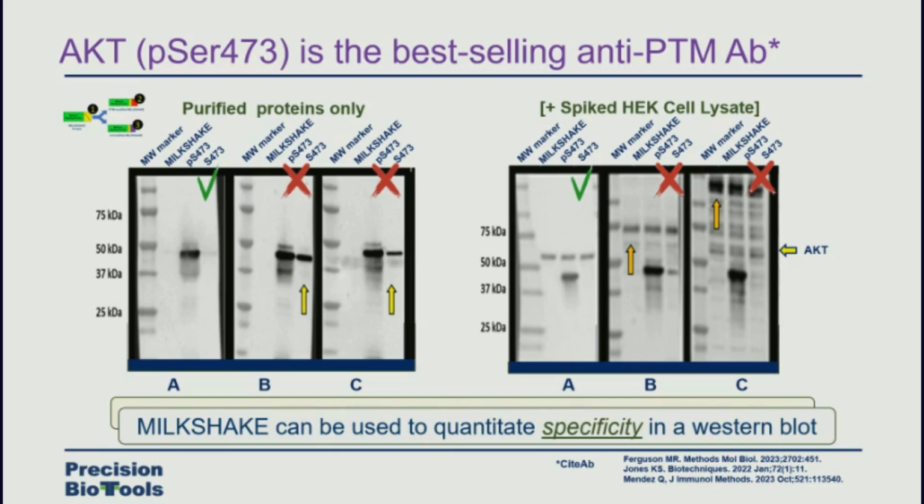If you go by publication number, A is used thousands of times as compared to B and C. So Andrew's not here, so I can say I don't know if I completely agree with him that 50% of all antibodies that are used are wrong. If you go by that number of 1,000 antibodies used, that is correct, as opposed to maybe 20 that are used in the other cases.